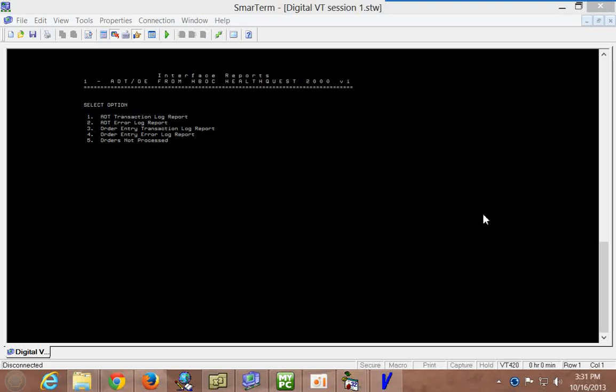This is a brief introduction to the HRP module for OL Monitor and the HRP report, if you're not familiar with it. Perhaps this looks familiar. This is how it appears in SunQuest.